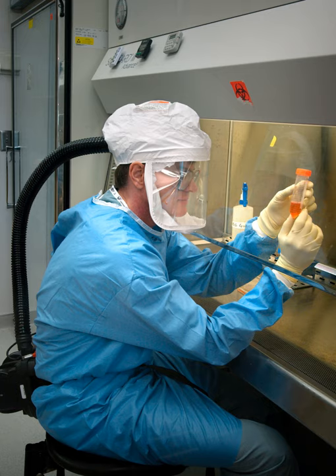Class 1. Class 1 cabinets provide personnel and environmental protection but no product protection. In fact, the inward flow of air can contribute to contamination of samples. Inward airflow is maintained at a minimum velocity of 75 feet per minute (0.38 meters per second).